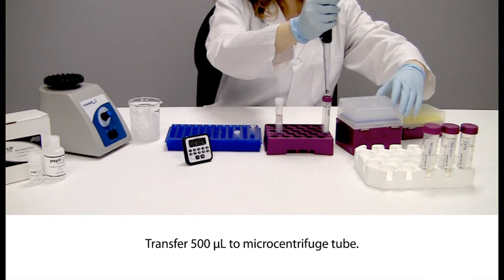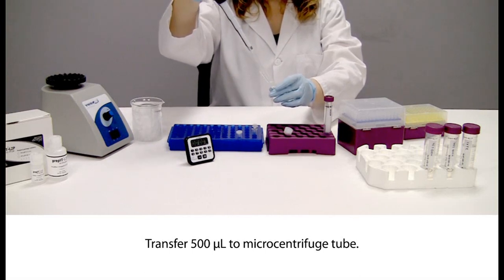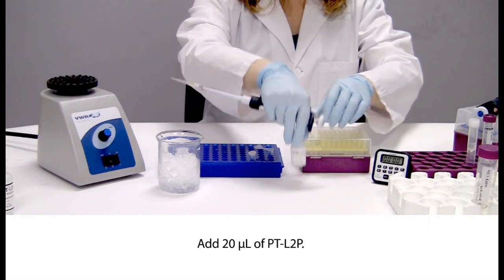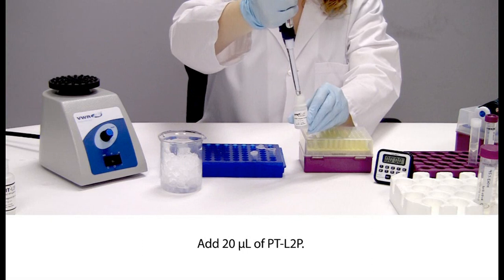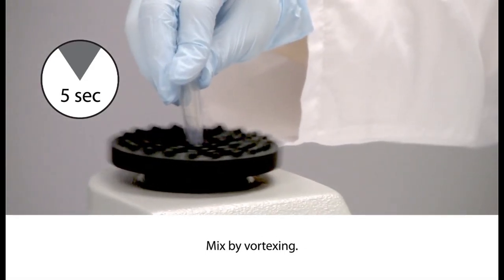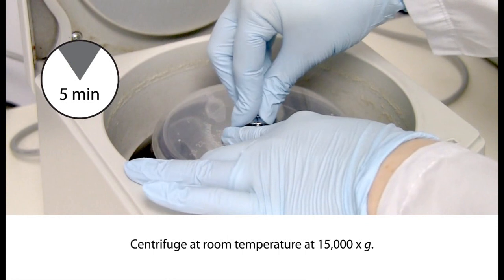Transfer 500 µL of sample to a microcentrifuge tube. Add 20 µL of prepIT-L2P. Mix by vortexing for a few seconds. Incubate on ice for 10 minutes. Centrifuge at room temperature for 5 minutes at 15,000 times G.